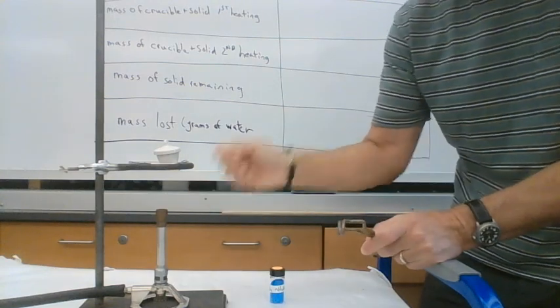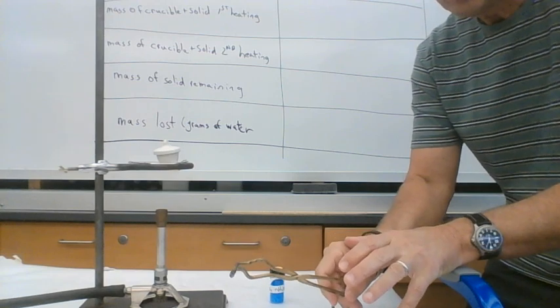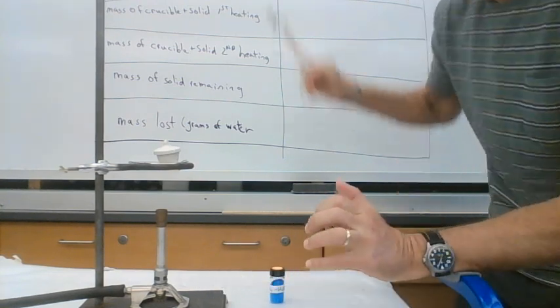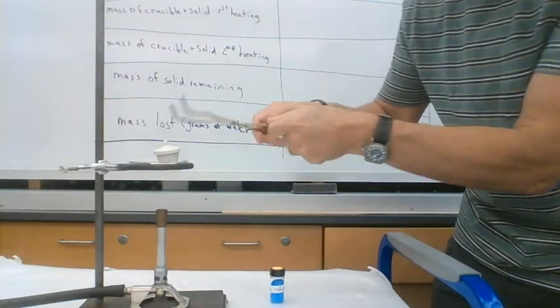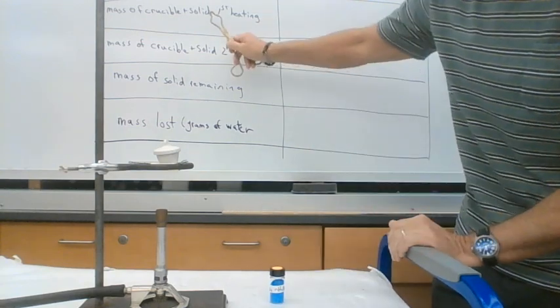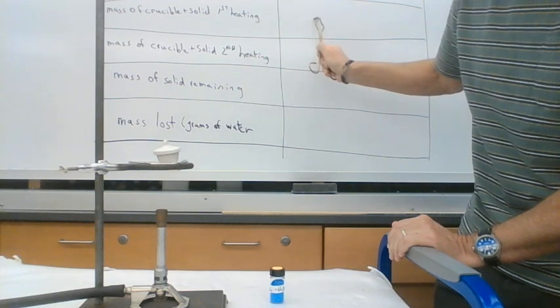The next thing we're going to do is heat this crucible up with the hydrate in it for about 15 minutes, and then we're going to let it cool and weigh it again. And we're heating it up to try to drive the water out, because that water is loosely bound. Then we're going to take the crucible off, weigh it again, and that would be the mass of the crucible plus the salt inside after the first heating.